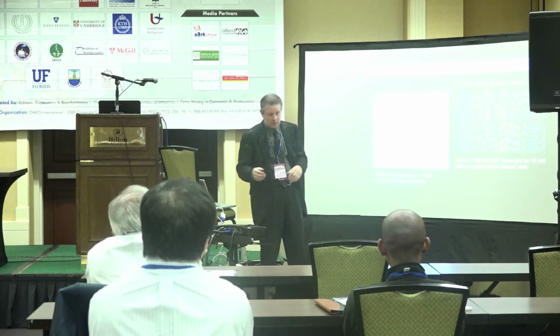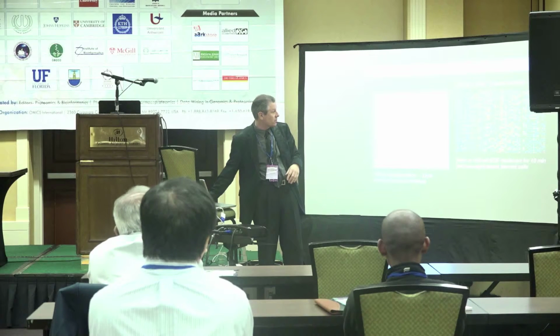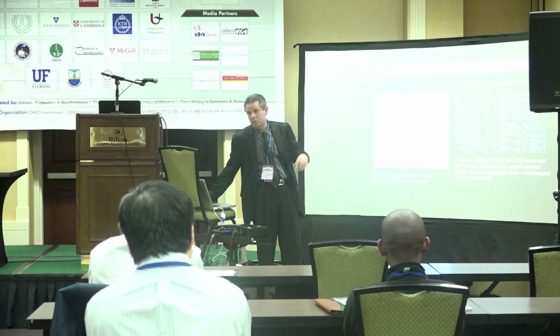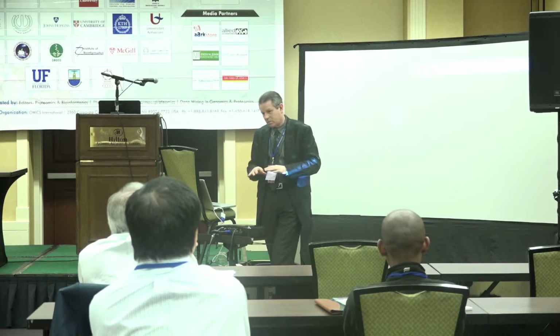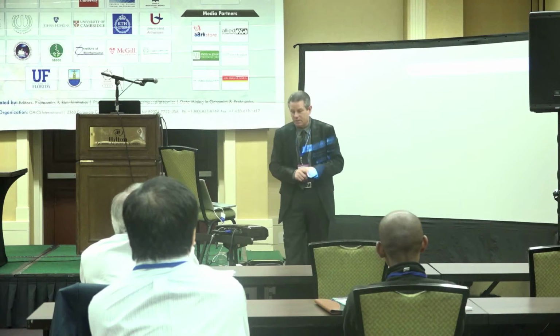So we can see changes in signal from A431 cells, with lots of spots that light up. And then when we overlay, we can see nice changes of what's gone down and what's gone up with these kinds of treatments. And they're each quantified. So that's the state of the art of what's available in the market today and what's been described.